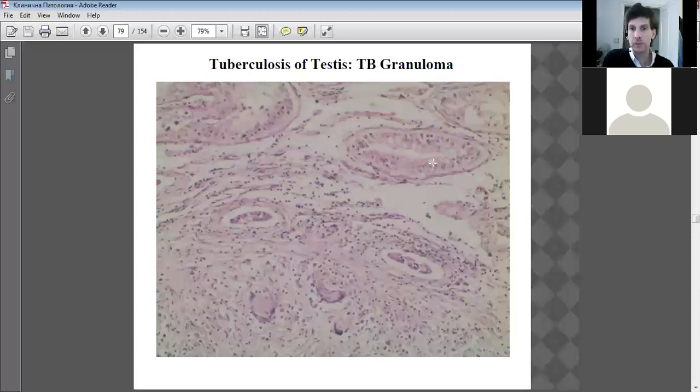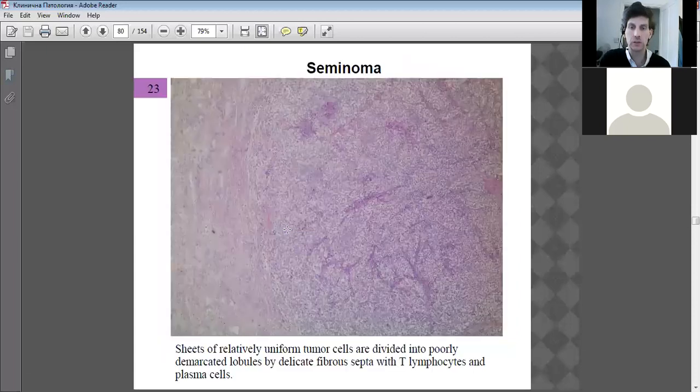And that's lipid accumulation, and that causes disruption to meiosis. Fibrous tissue forming. Epithelioid cells, macrophage migration through the epithelioid matrix towards the center of the granuloma to attempt to isolate the necrosis.